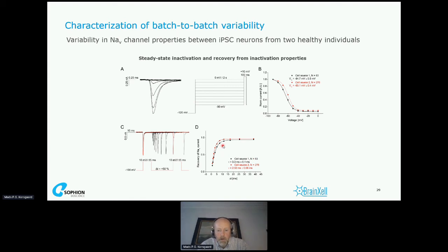So even if there are error bars, they're very, very small and hidden in the dots. So these are actually statistically significant differences between a batch and another. So of course that makes it a little bit more difficult to be absolutely certain about the differences you see, unless you have the patient being his or her own control cell population.